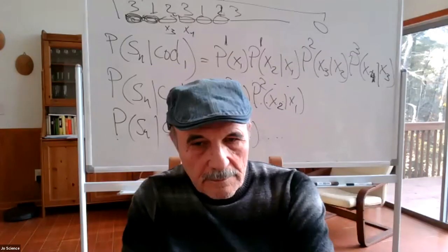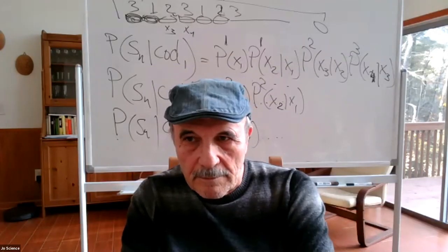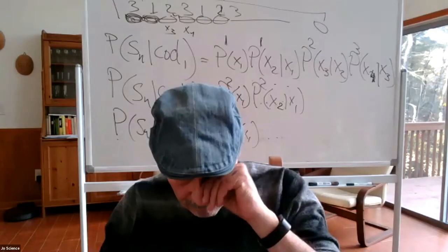In terms of training, it's not as straightforward because it comes down to the length of a repetitive sequence and the length of the genes predicted in repetitive sequence. Short genes are not used in training, and these short genes are frequently predicted in repetitive sequences.